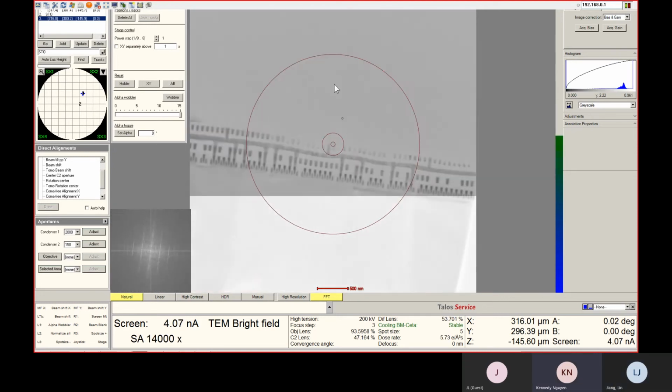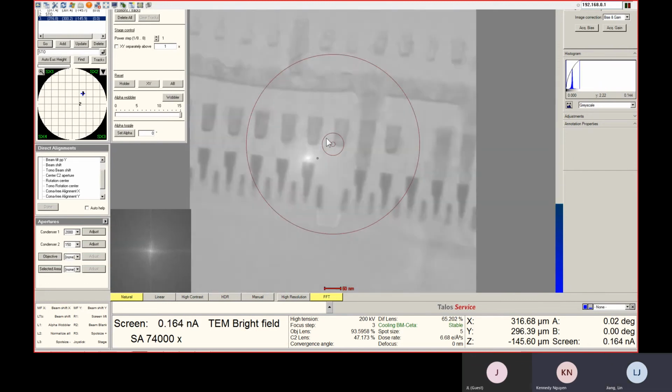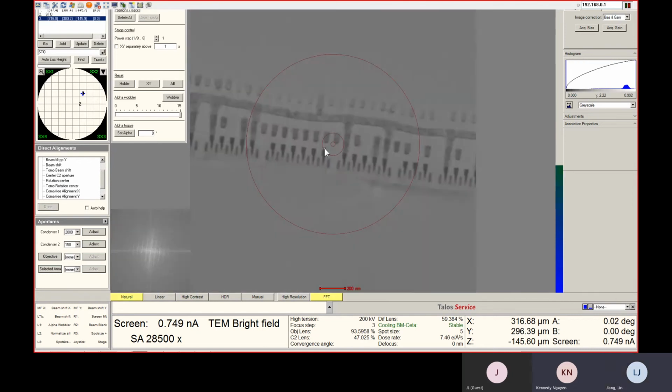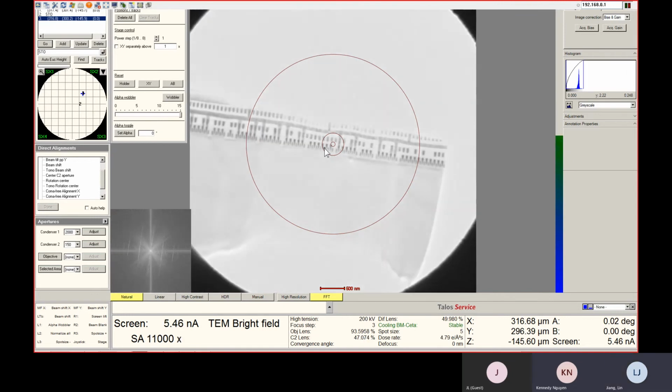Okay. Let's zoom in over here. Okay, and then we'll hit rotation center. Okay, looks like it's good. So this is basically the alignment's done now. Yep. And then do you want me to go over dark field imaging or just bright field first?